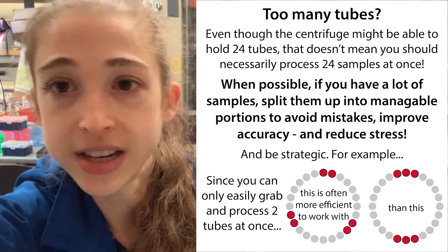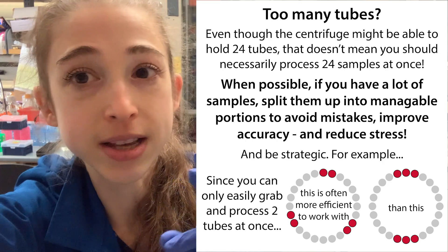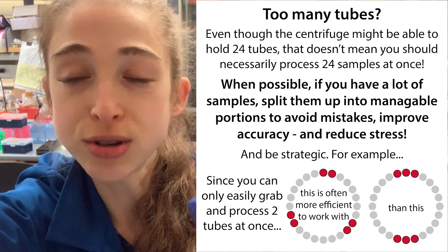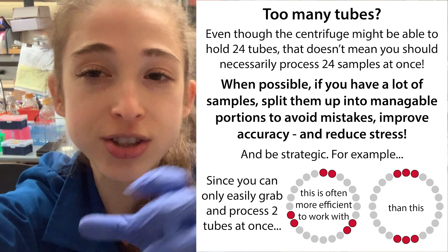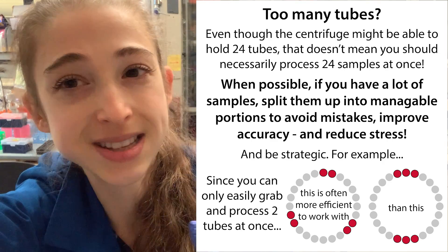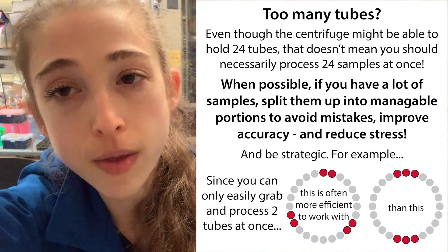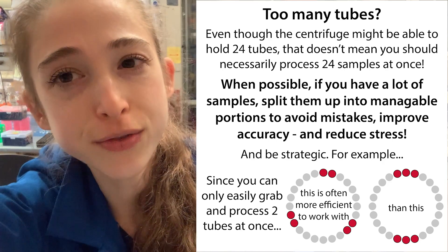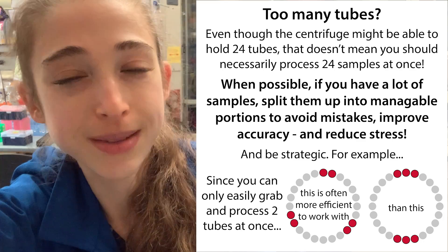Don't try to rush in and do it all at once. It's really okay to take things slower and do a couple of sets. It makes your life a lot easier and a lot less stressful. Don't feel bad about not cramming all of them into the same stretch. If you have to do your mini prep twice with two different sets, that's not a big deal. But if you mess up all of your samples and have to go back and regrow the bacteria, that's going to be a lot more time consuming. So it's more efficient in the long run, even if it's a bit of a pain in the short run. Split things up and have fun.